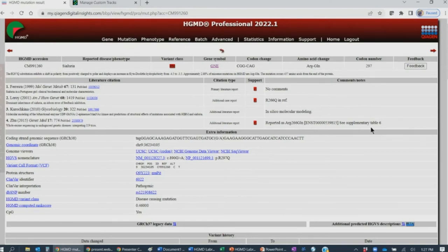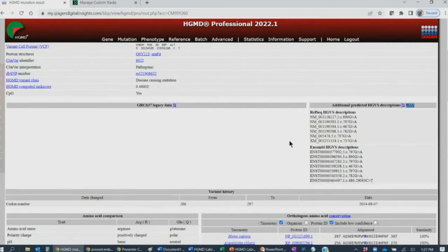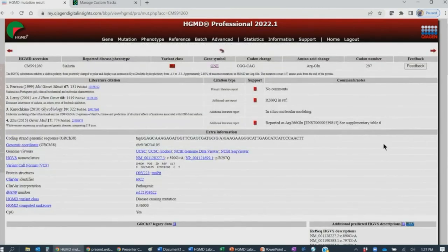Something users find particularly helpful is the comments and notes section, where reviewers add notes to help clarify things. For example, we are looking at a codon 297 change, but within the Leroy paper it indicates a codon 266 change. The reviewers note that another publication reports it the same way and gives the Ensembl transcript. The comments will also tell you where to find the variant — for instance, if it's only listed in supplemental tables. The reviewers are not only reviewing the body of text but also graphs, figures, and supplemental tables. HGMD also has an Additional Predicted HGVS Descriptions feature listing all RefSeq transcripts, HGVS descriptions, and Ensembl transcripts, giving key insights for your literature review.